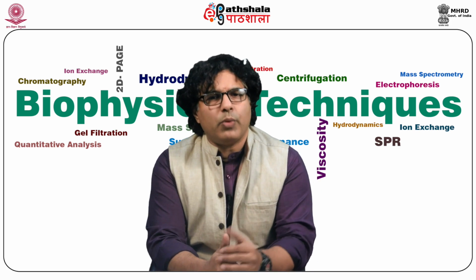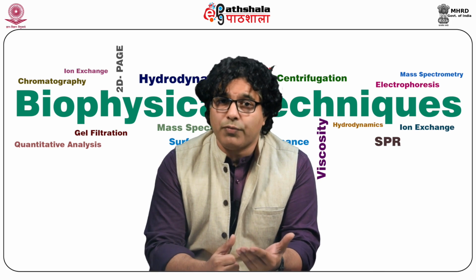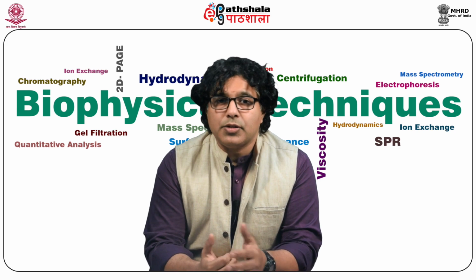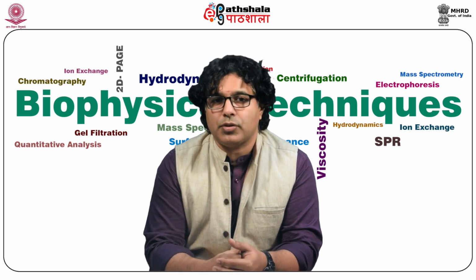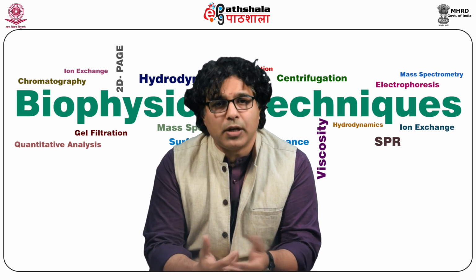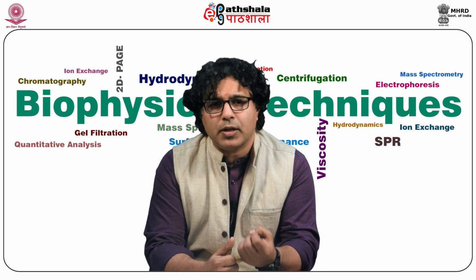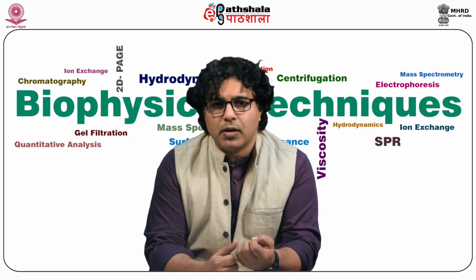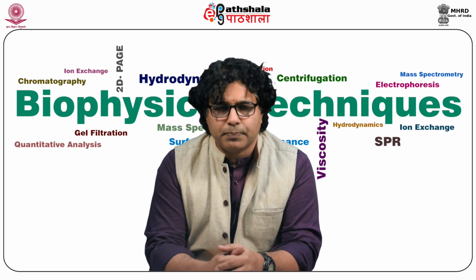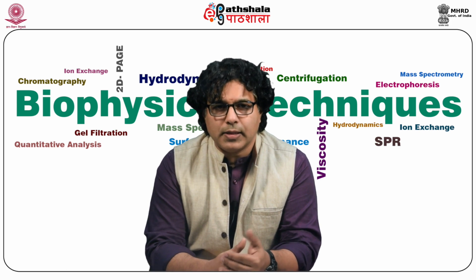We go for liquid-liquid extraction. For example, your substance is in a liquid form in the plasma, and you use chloroform or methylene chloride to do a liquid-liquid extraction, in which you try to take out selectively your compound by using an organic liquid, and you evaporate the organic liquid to fetch the compound of interest, which can be subsequently dissolved in the mobile phase, which can be used for an HPLC. Next is solid phase extraction, which I will show you in the subsequent slide.